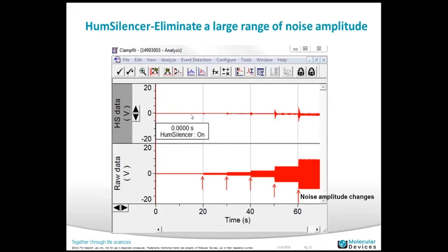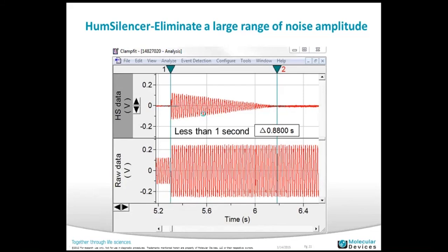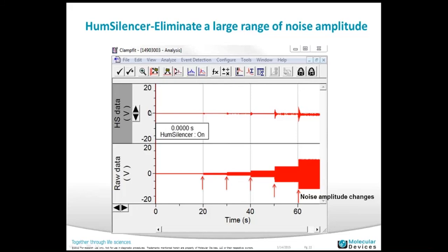Another important feature is that the Hum Silencer can handle a large range of noise amplitudes. In this experiment using the Axopatch 200B, when I change the gain you can see the noise amplitude increases. The Hum Silencer is still able to learn and eliminate the line frequency noise even as the amplitude changes, adapting each time the gain is adjusted.